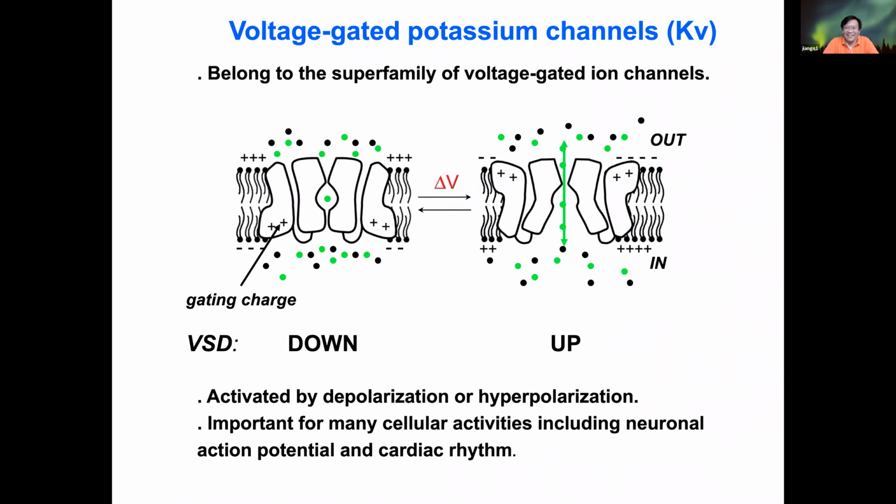Inside the cell, it is about 140 to 150 millimolar potassium chloride, and there are also 2 to 3 millimolar magnesium chloride, and a very low concentration of calcium, of course. So it's very close to the high salt condition we used. The low salt condition we used is usually below 50 millimolar.